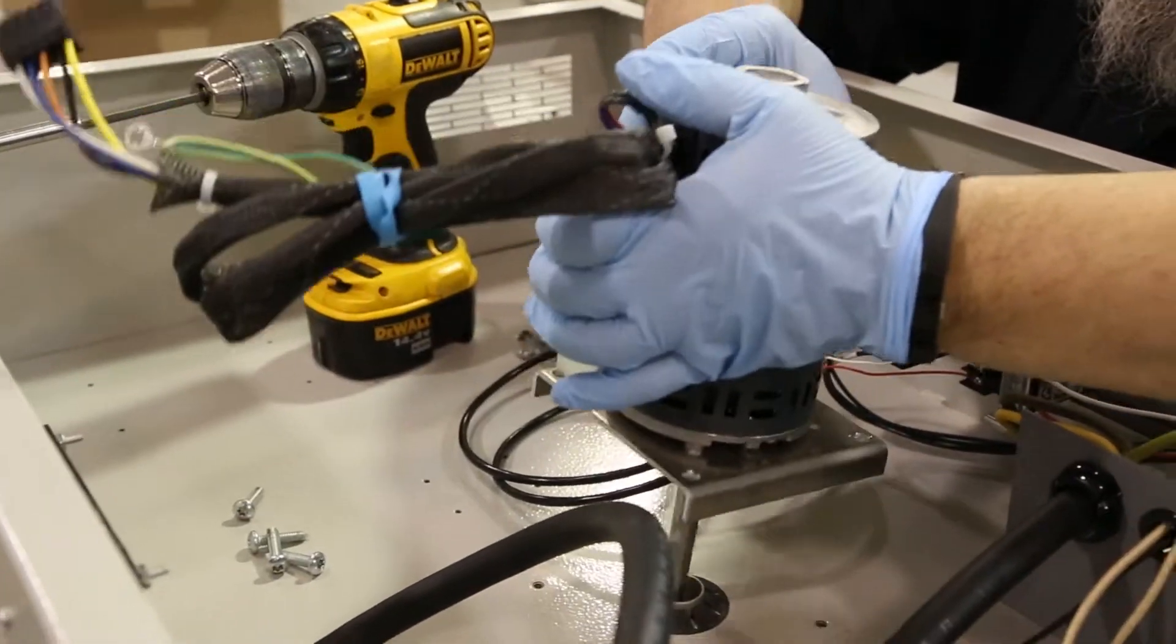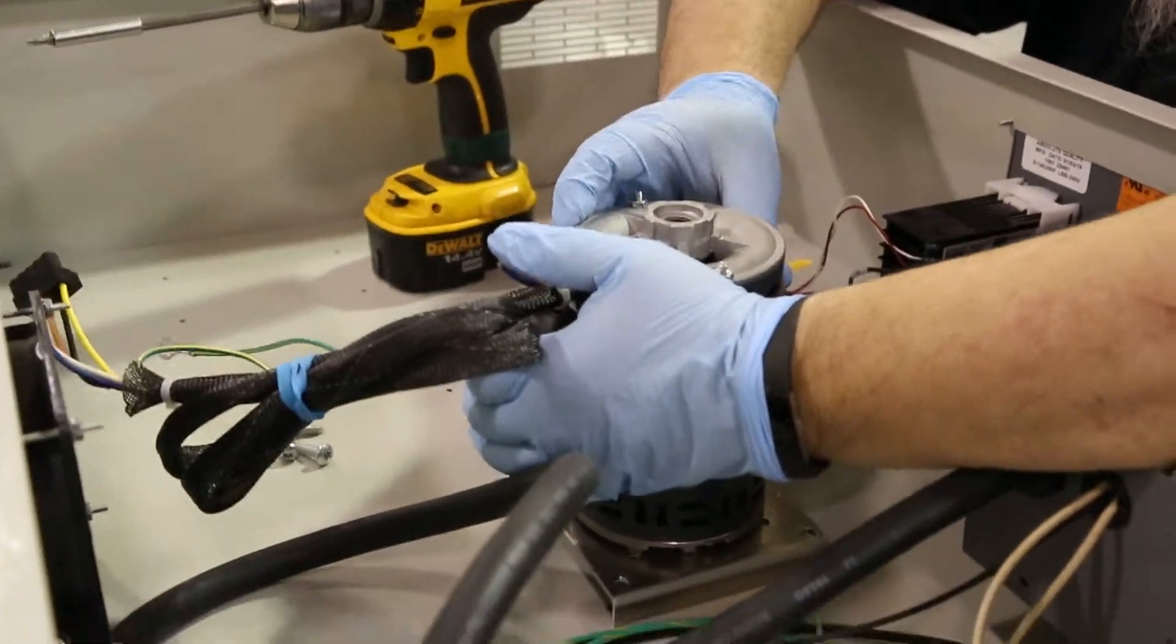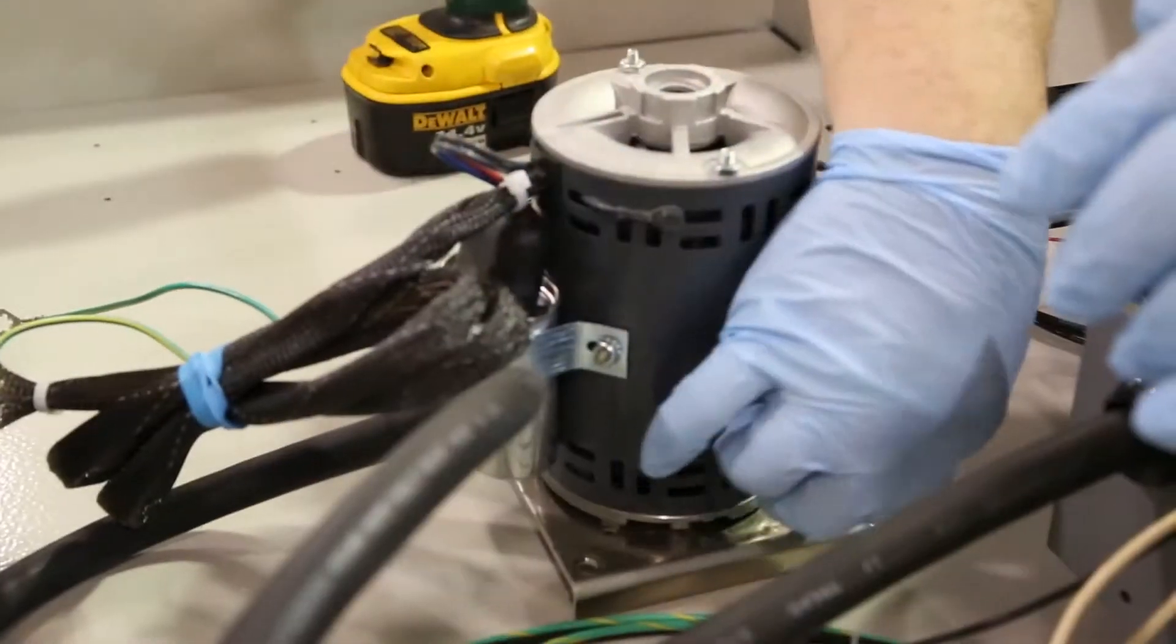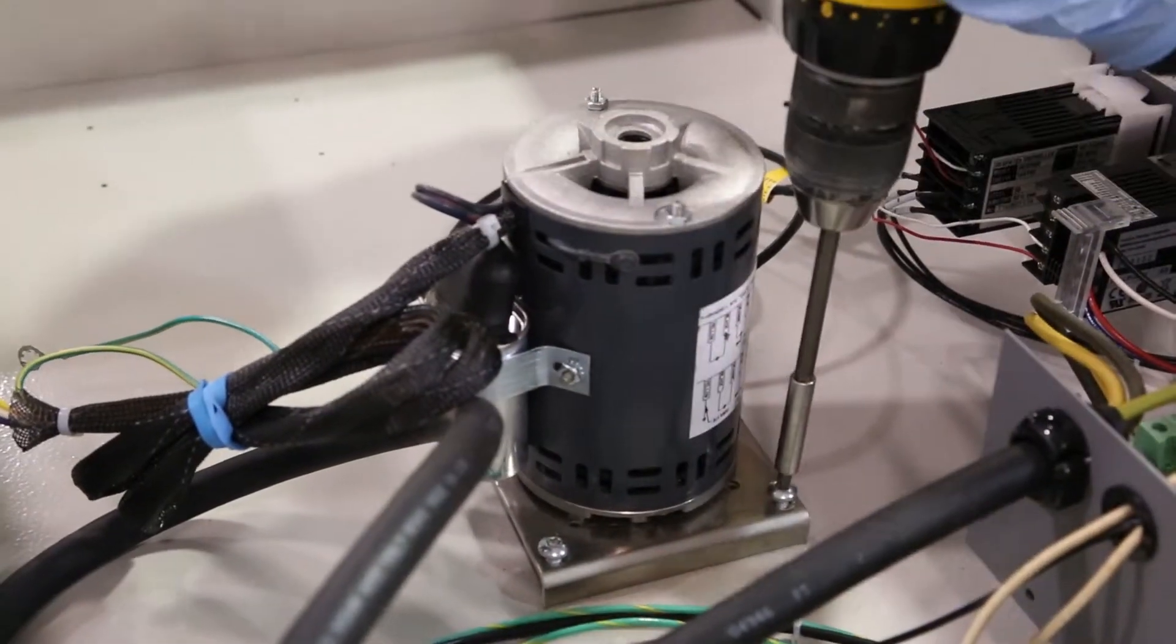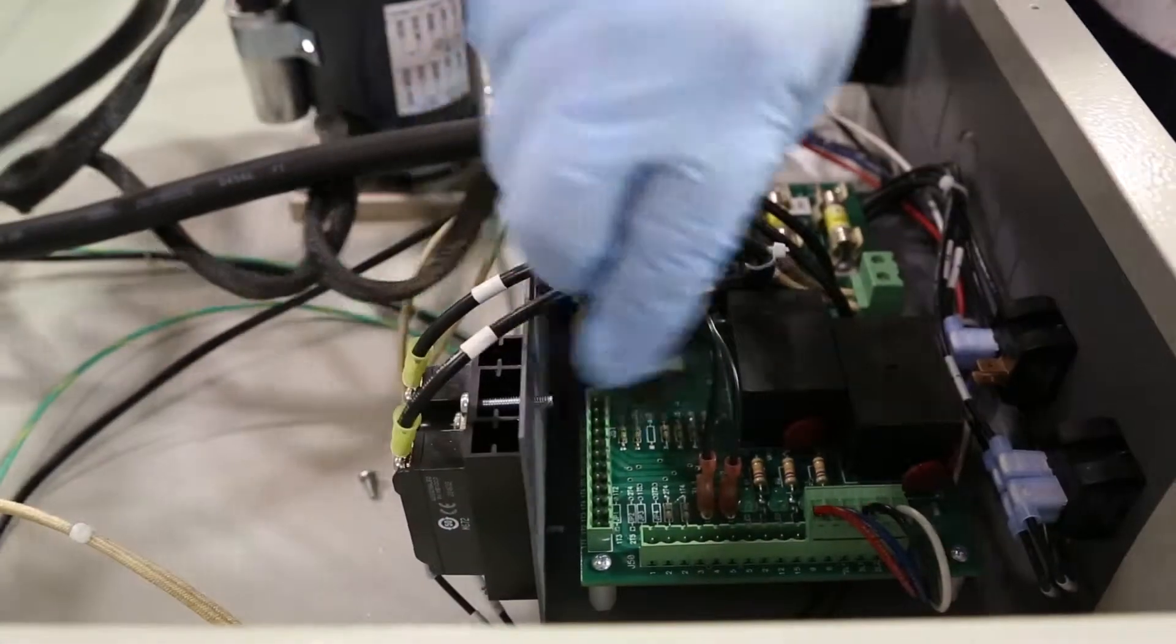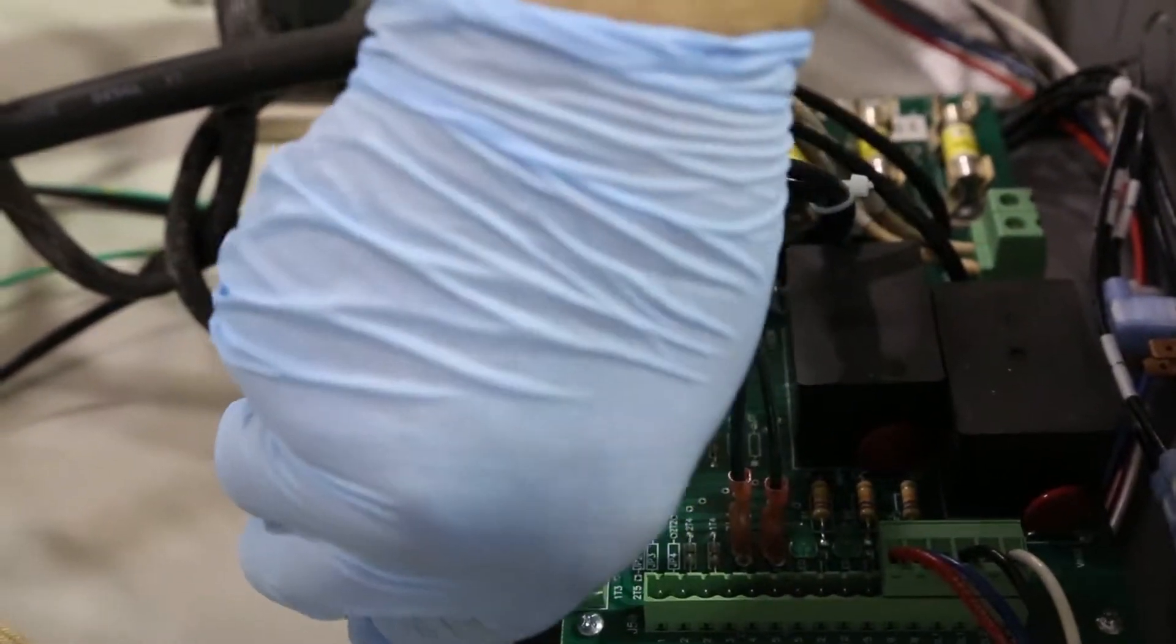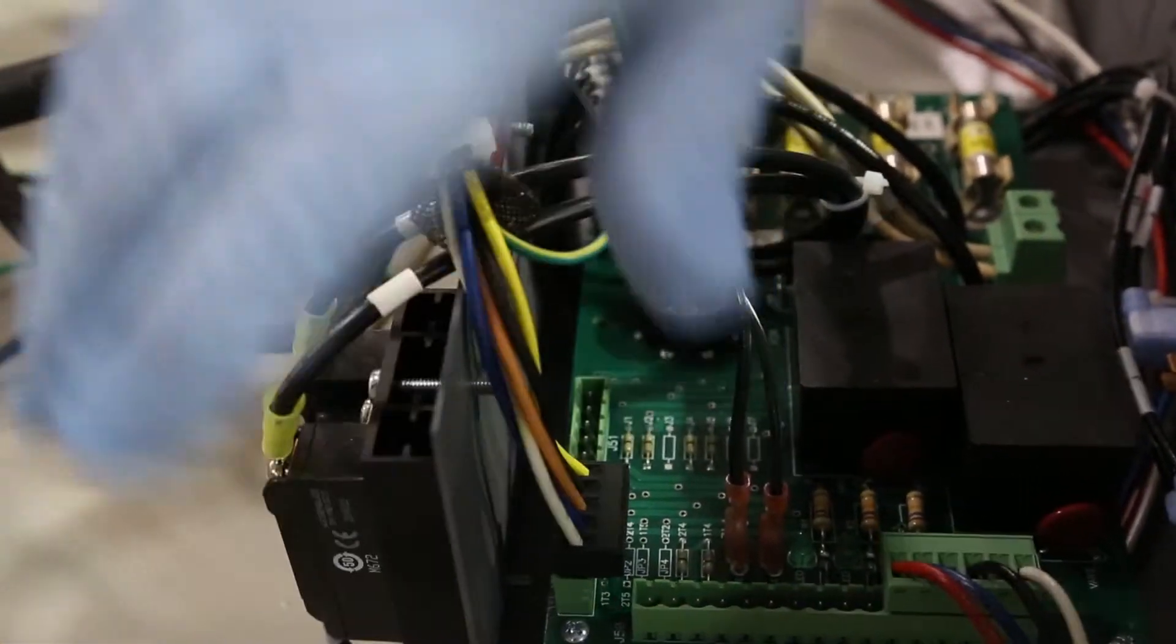Set the motor back in place and secure to the oven with four fasteners. Connect the motor lead to the controller in the exact position you removed it. Refer to electrical schematic if you are unsure.